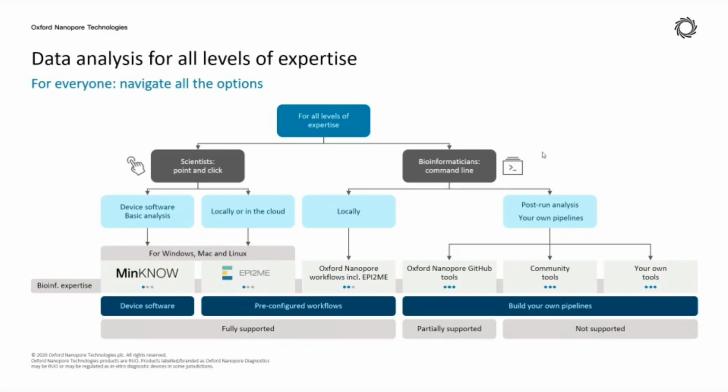So most of the software developed by the public or the community will be in the command line. The ones developed by ONT, the MinKNOW and EPI2ME, both come with a graphical user interface, where users do not really need to learn how to do commands in order to do the analysis. Other software, especially from the communities, mostly comes in a command line interface. And if the command line interface is still a preferred way to do the data analysis, the EPI2ME workflow can also be run by using the command line.